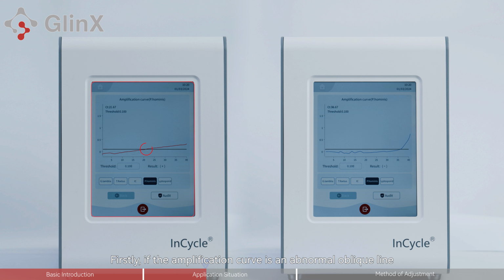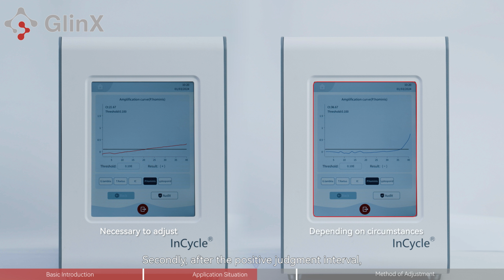Firstly, if the amplification curve is an abnormal oblique line rather than a typical S-shaped or S-like shape, the threshold line must be adjusted upward so that it has no intersection with the amplification curve. Secondly, after the positive judgment interval, if the amplification curve shows typical exponential amplification, indicating a low pathogen content in this sample, the threshold can be adjusted according to the actual situation.